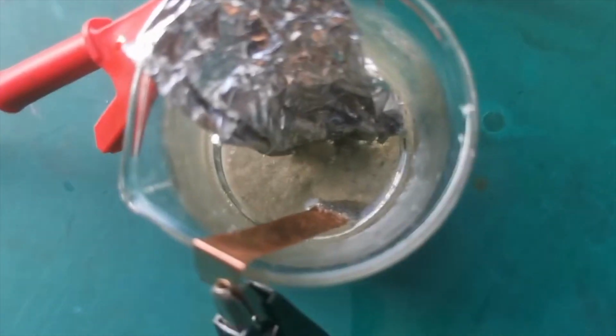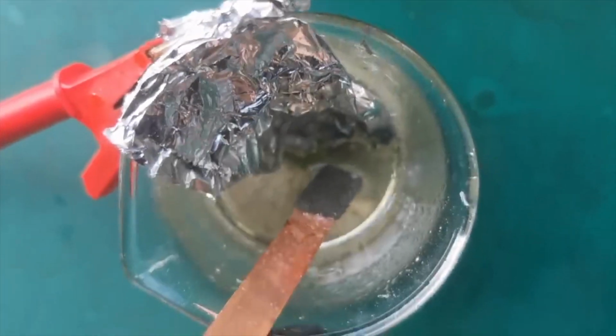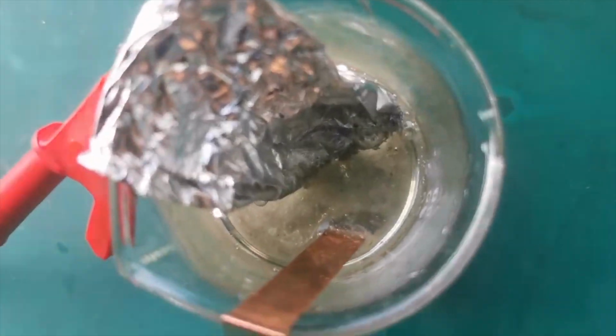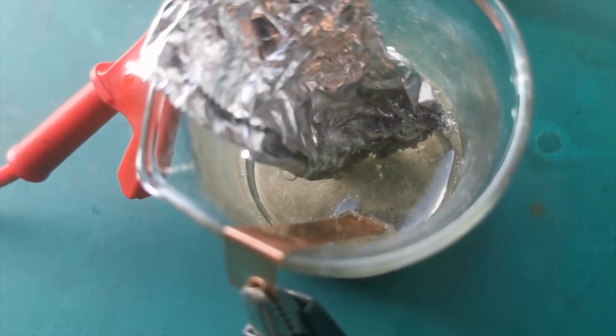I tried to measure the current, but it was so small that my ammeter cannot detect it. There may be occasional bubbles forming on the electrodes, but apart from that, the only thing changing is the color of the copper cathode, which gradually turned completely covered by a gray layer of lithium.